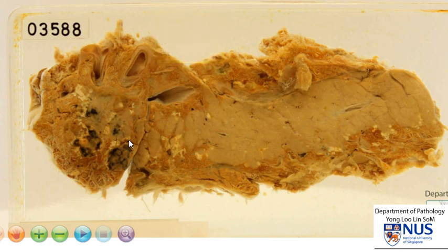These findings are indicative of acute hemorrhagic pancreatitis. Usually, in addition to this hemorrhage and fat necrosis with saponification, we can also see edema and necrosis of the pancreatic parenchyma, which is not so obvious in this particular specimen.